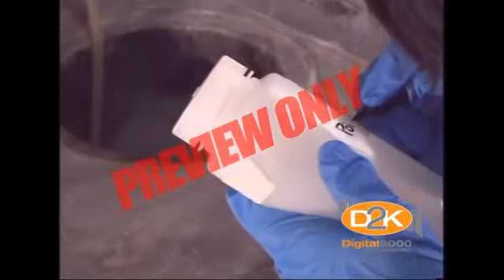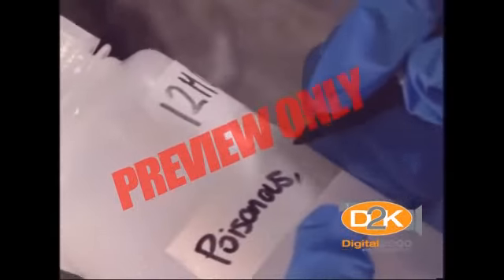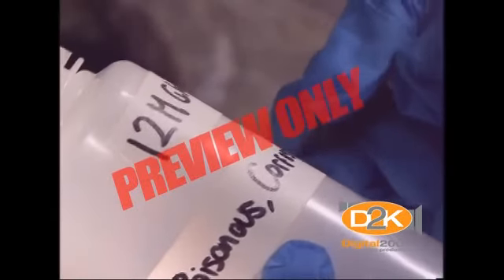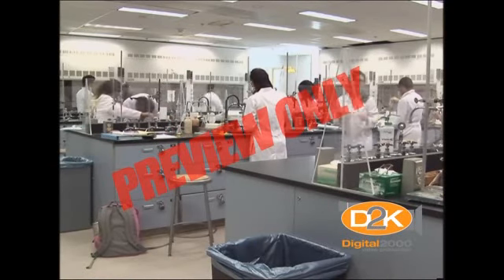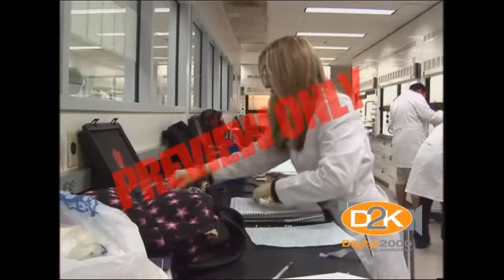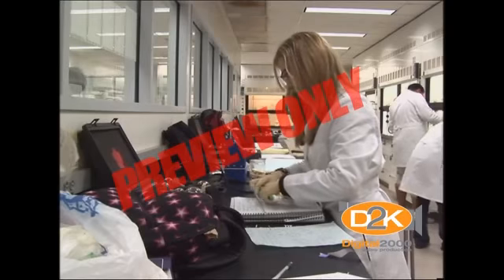Be sure to carefully label all chemical containers with chemical contents, no abbreviations, acronyms, or chemical formulas, and chemical and physical hazard warnings. Benchtops must be capable of supporting the weight of equipment and should be resistant to chipping or damage from routine laboratory operations. Desks and shelves should never be used as a substitute for properly designed benchtops.